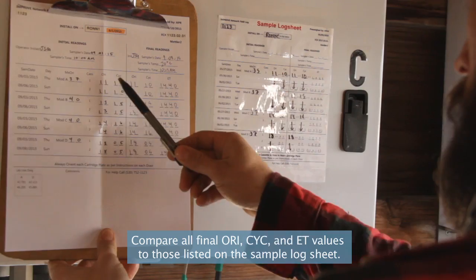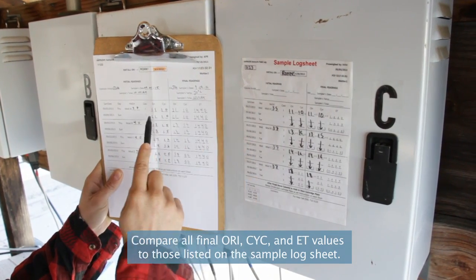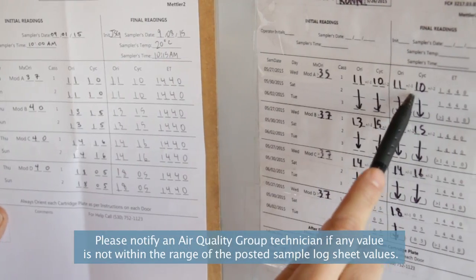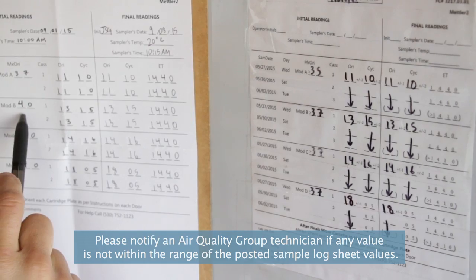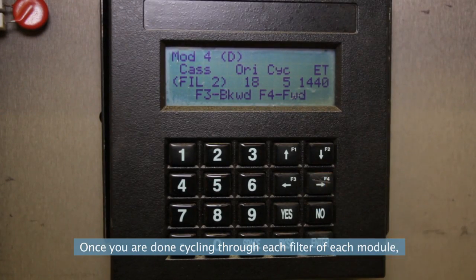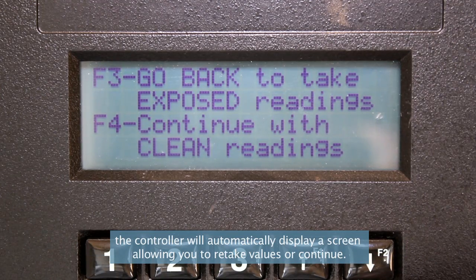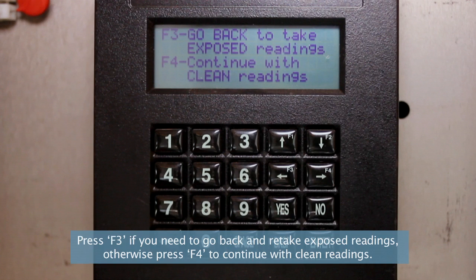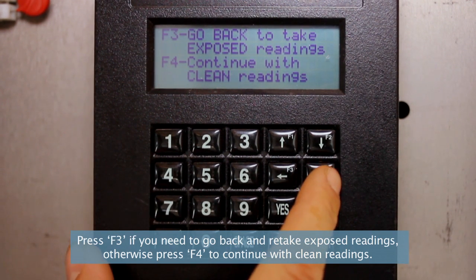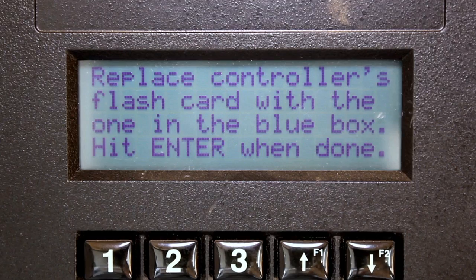Compare all final ORI, CYC, and ET values to those listed on the sample log sheet. Please notify an air quality group technician if any value is not within the range of the posted sample log sheet values. Once you are done cycling through each filter of each module, the controller will automatically display a screen allowing you to retake values or continue. Press F3 if you need to go back and retake exposed readings. Otherwise, press F4 to continue with clean readings.